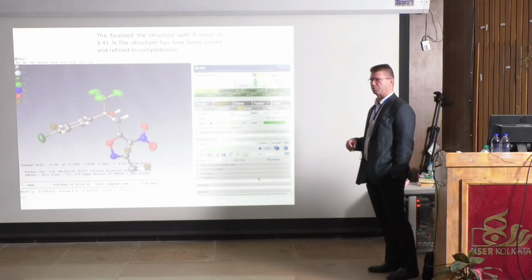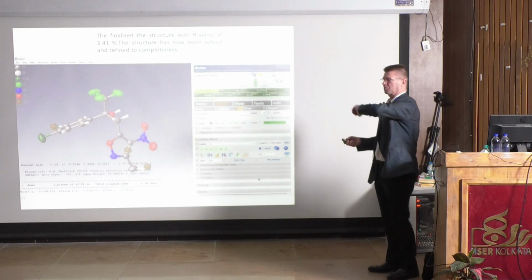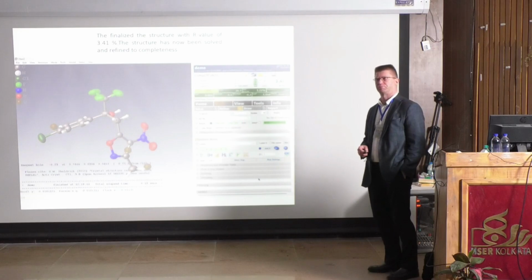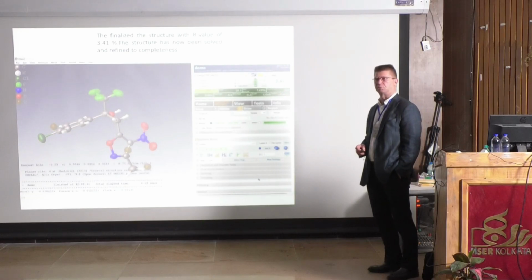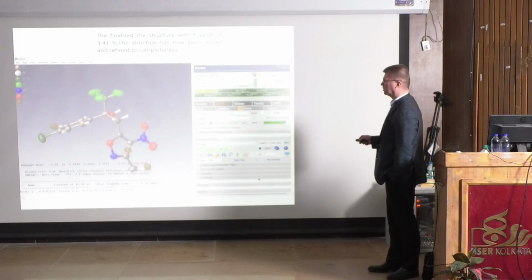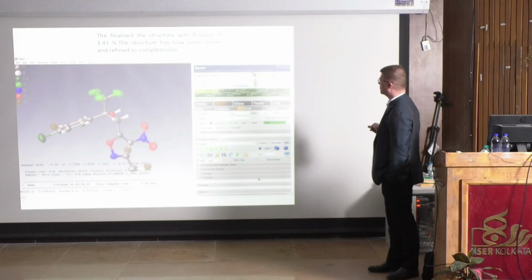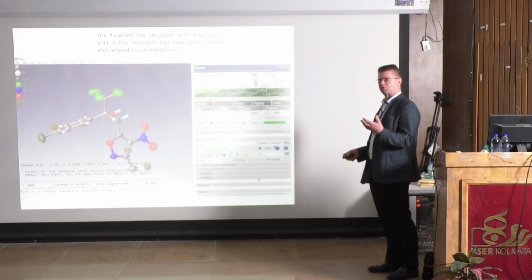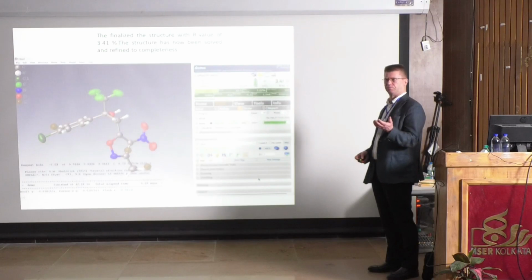And this is the whole thing. I will demonstrate that with Olex2 now, since it doesn't take too much time. So we are roughly on time. It takes about, I would say, 30 seconds. So this is the idea of refine everything. Everything's fine. You can see everything is green. And now you can see here a number. This number appears only when we have a chiral structure with a pure enantiomer.